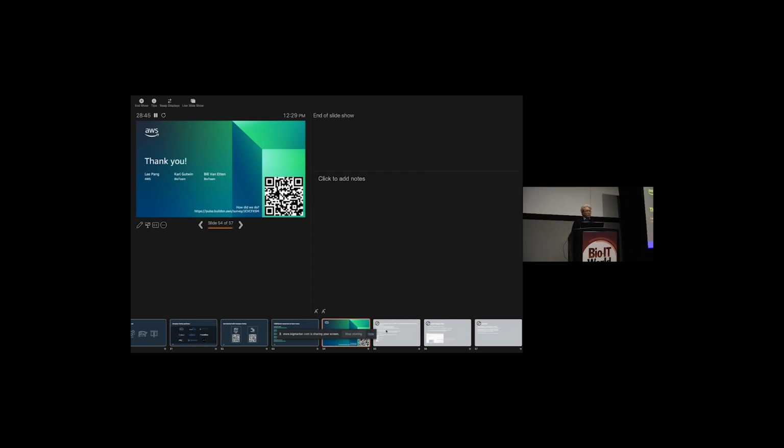Sorry, is that in reference to the workflows piece? Yeah, so for example, in an aligner, if you could stream in your FASTQ, you wouldn't have to download and then start from the download stage. If you have tooling that can support it, I think you can do that.